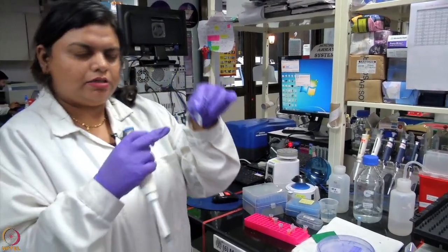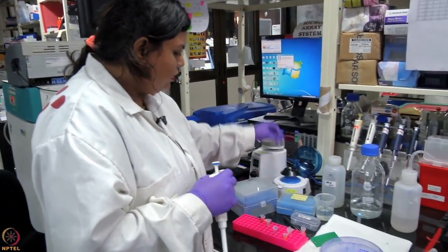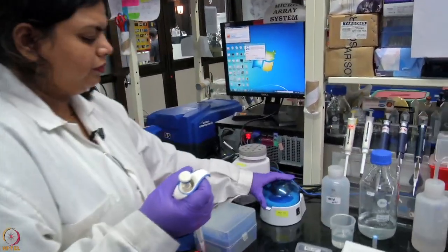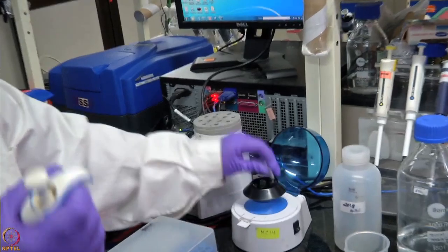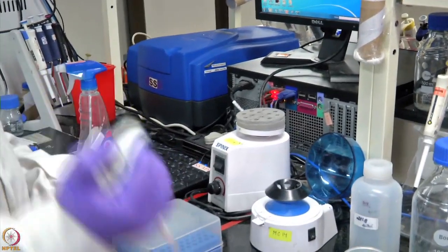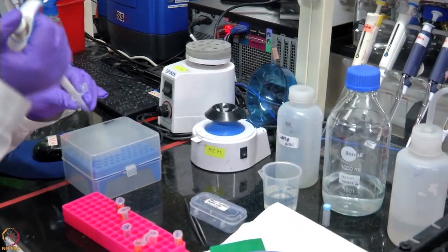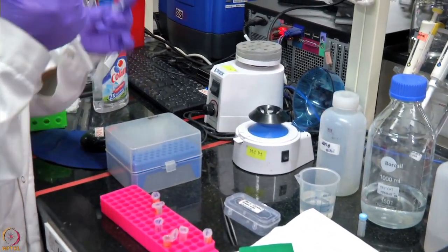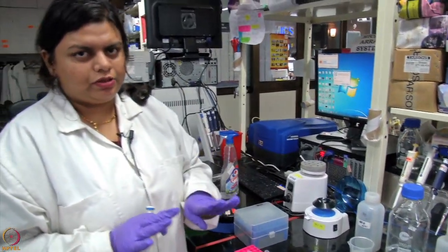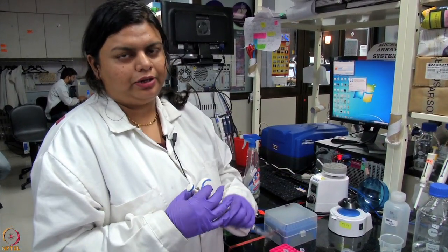So we will gently mix the buffer with the complex and then again do the centrifugation. After giving a gentle spin, we'll again store the flow through in a separate tube. This step will be repeated for 2 to 3 times. You can even go up to 5 times, depending on the specificity of your antibody.